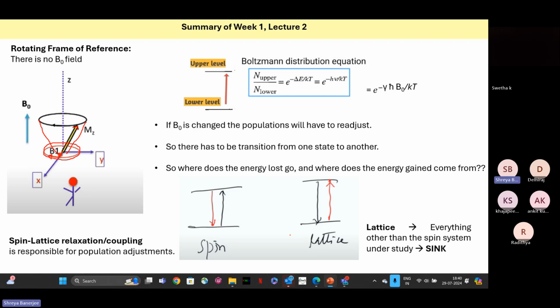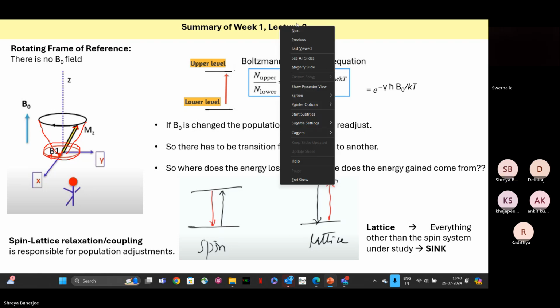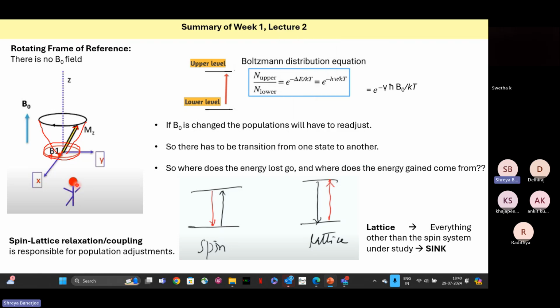Right. So you can imagine that your observer is sitting along this red circle, and the observer is also moving, and the angular momentum vector is also precessing in a Larmor precession motion along this black circle. If both these motions have the same frequency, then to the observer there is no motion at all.